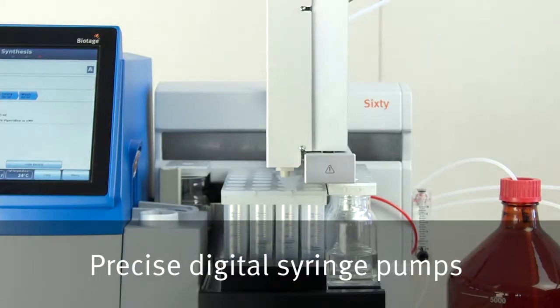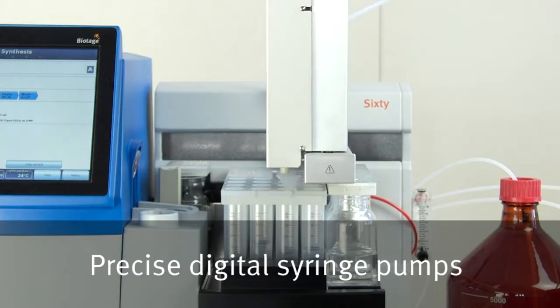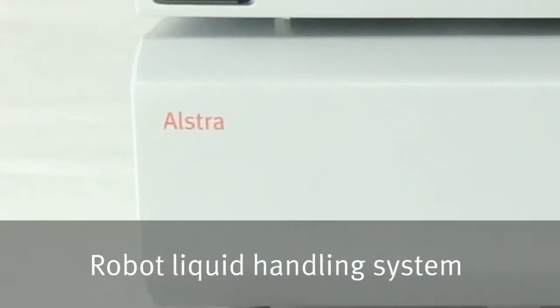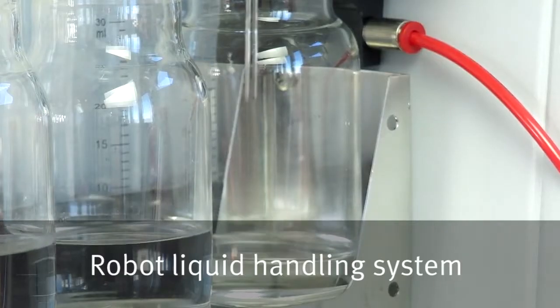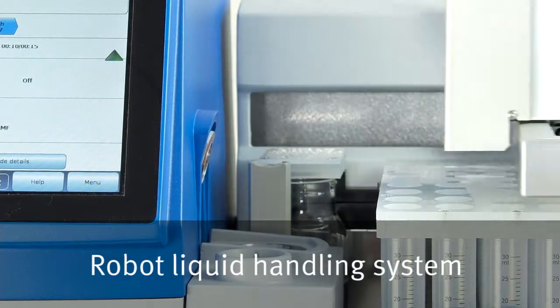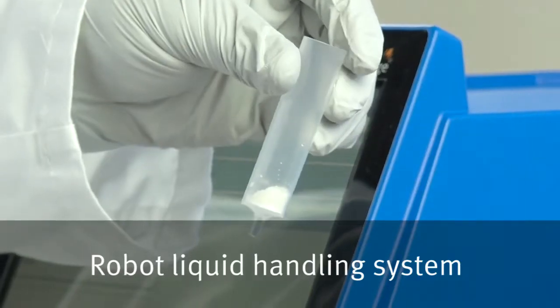The superior liquid handling system can handle high concentrations of reagents and dispensing volumes from as low as 100 µL is no problem. The system's robotic liquid handler and precise digital syringe pumps reduces reagent and solvent consumption, thus reducing cost and minimizing waste, essential when using expensive building blocks.